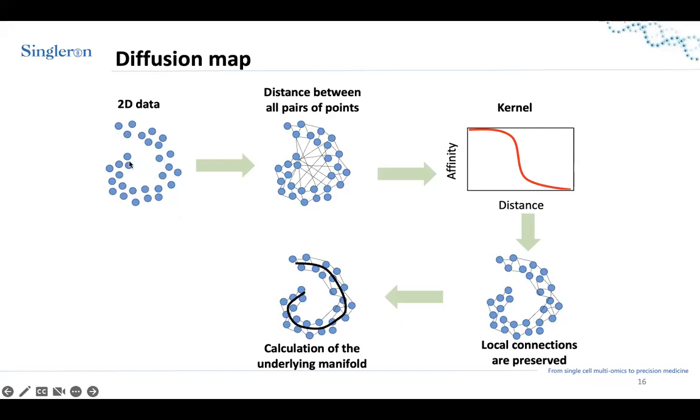So you see that if you use ICA or PCA, you will definitely not be able to capture this obvious path that might indicate some biology. We see by eye that it has a spiral shape, so there is probably something happening along this direction, but ICA and PCA would not be able to capture that because they are linear methods. They just find the components along straight lines.